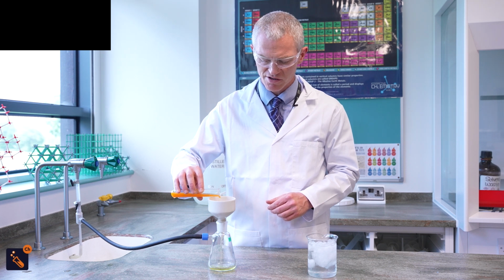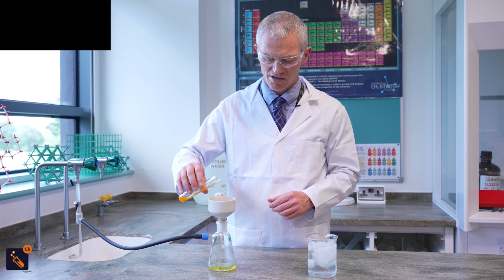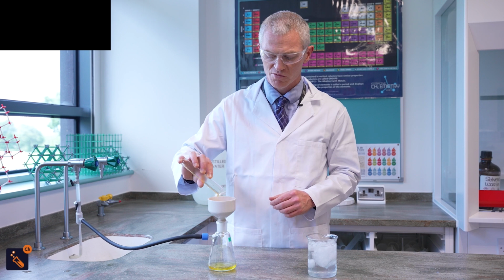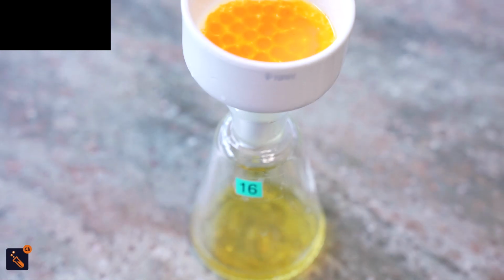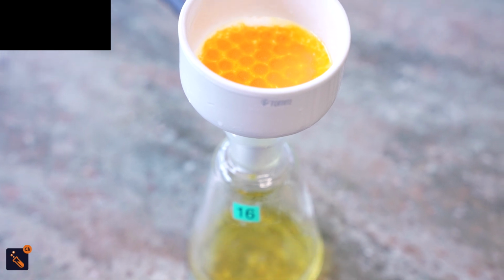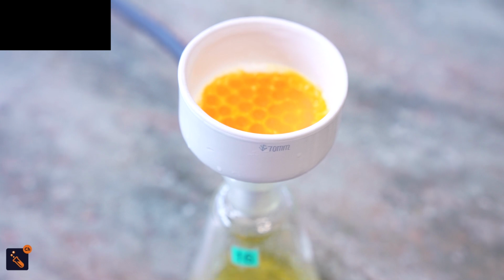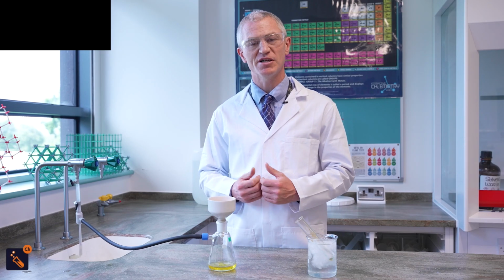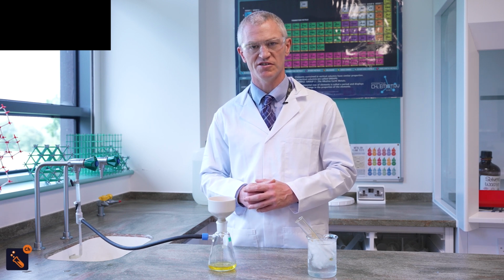So you've got to pour it slowly and pour it down the center. It will be sucked through by the vacuum, and you will start to get your orange precipitate which will form on the paper. Once you have filtered this, you leave it to dry for a day or so, usually in the fume cupboard at your school, and then you can perform a melting point analysis to identify what the actual ketone was in the first place.